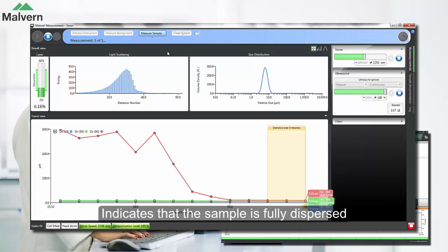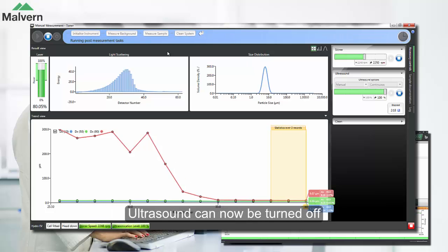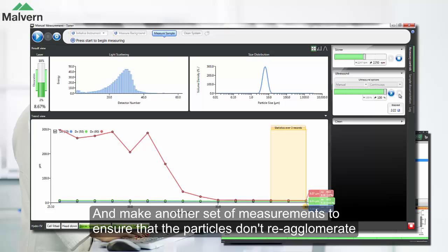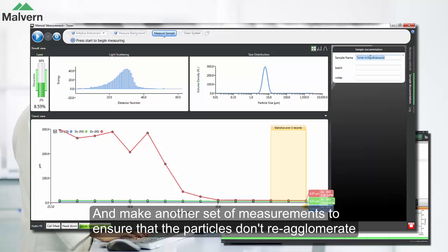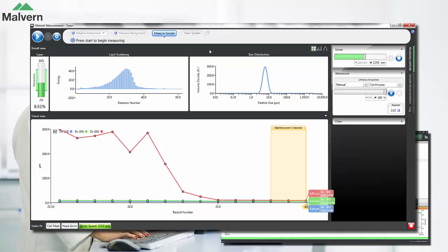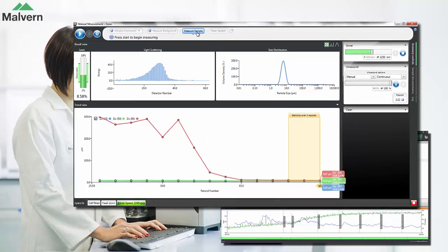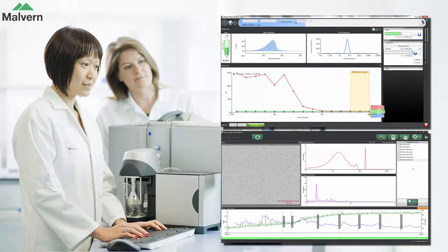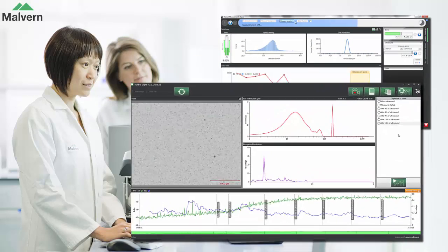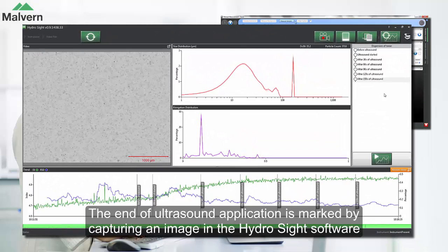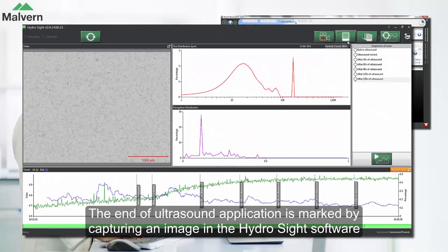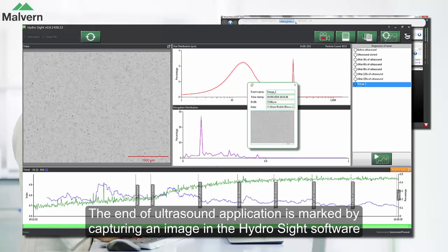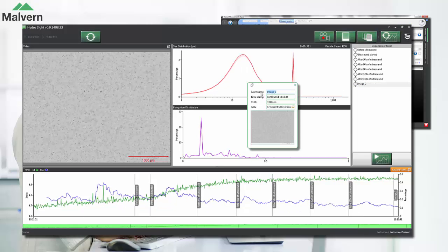We can now turn off the ultrasound, but we'll also make another set of measurements after ultrasound to make sure that the sample dispersion is stable and that the particles don't re-agglomerate. We'll also mark the point where we turned off the ultrasound by capturing an image in the HydroSight software.